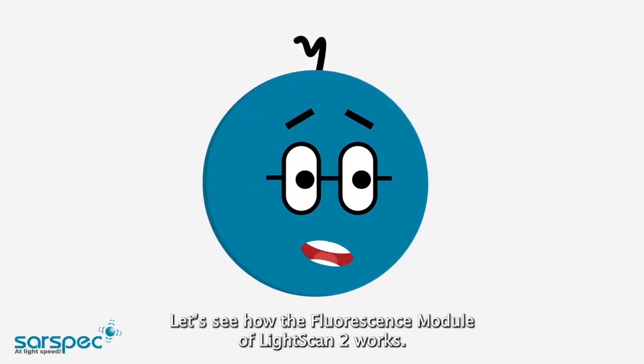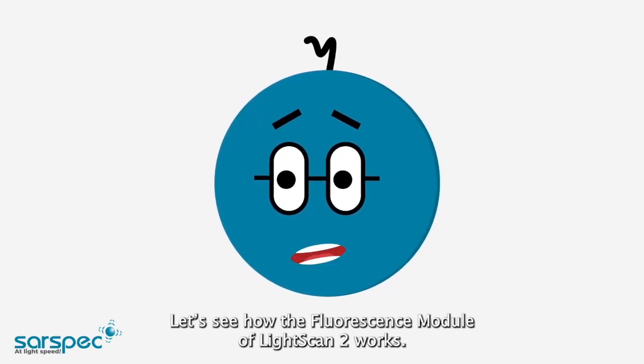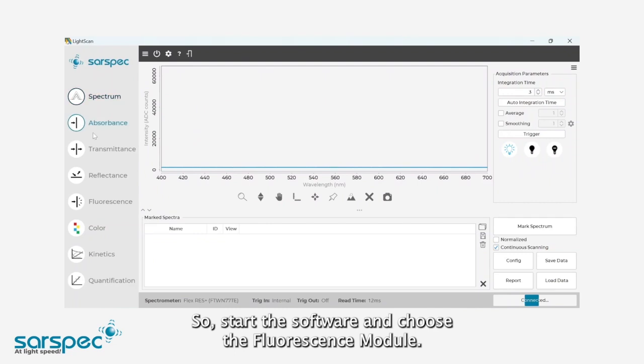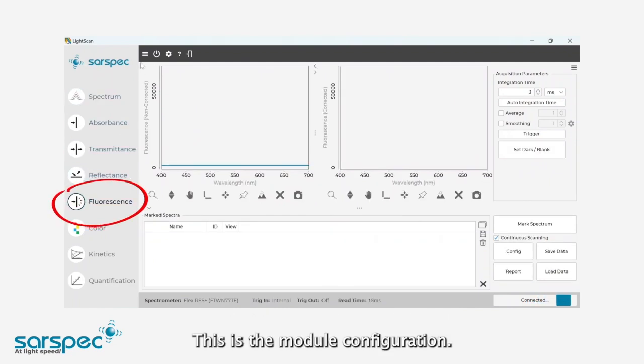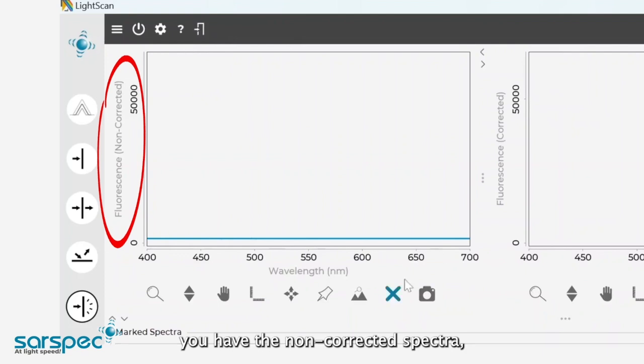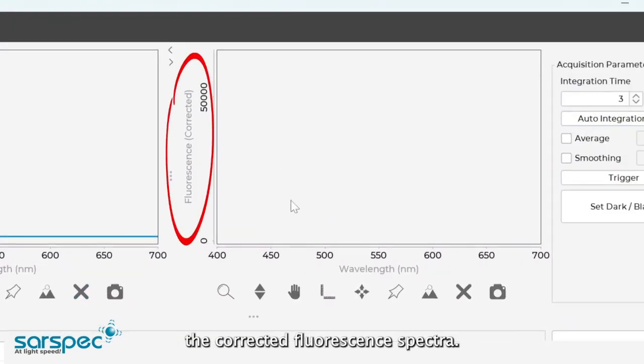Hey, let's see how the Fluorescence Module of LightScan 2 works. So, start the software and choose the Fluorescence Module. This is the module configuration. On the left, you have the non-corrected spectra, and on the right, the corrected fluorescent spectra.